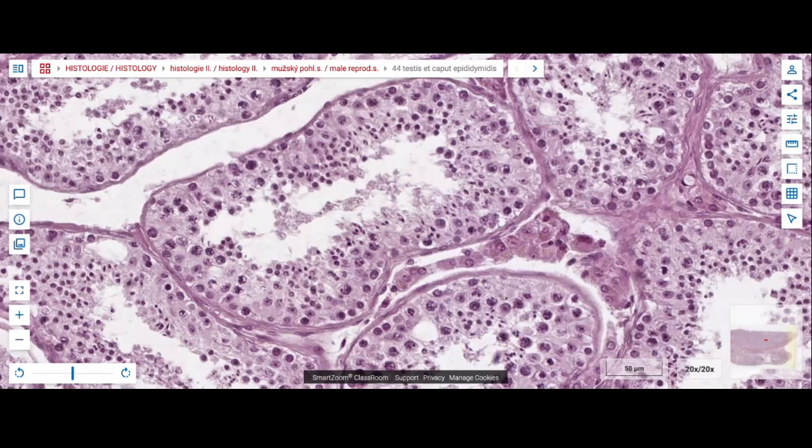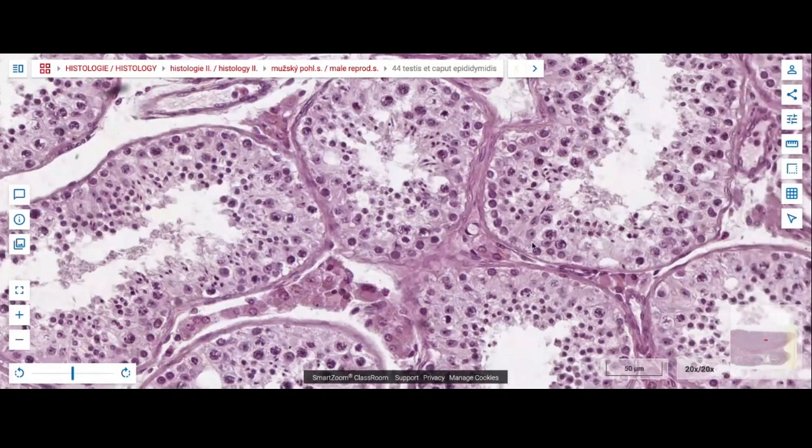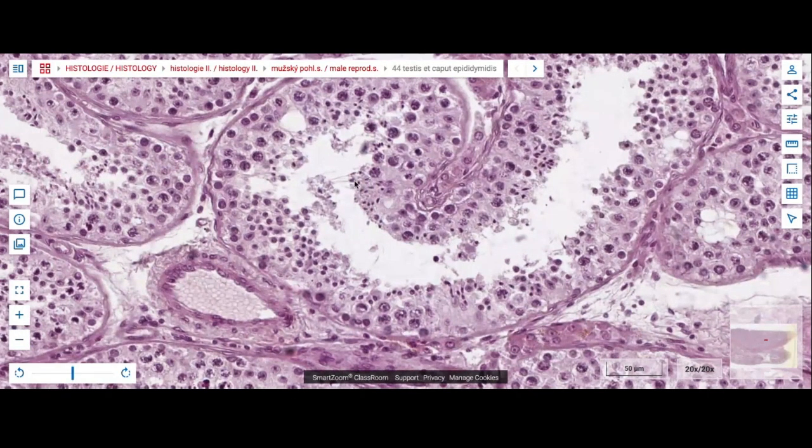The spermatids are very small, and they have a rounded nucleus which is also really dark. They're located right next to the lumen. So this would be a spermatid, and so with this and this, all the small cells which you can see here are your spermatids. These spermatids further undergo a process called spermiogenesis, which forms the mature spermatozoa. These are seen near the lumen, and they have a droplet-like shape. This structure over here would be a mature sperm. Or let me see if I can find other ones. Yes, these tiny structures which don't have a circular nucleus, with a raindrop shape, are your mature sperm.